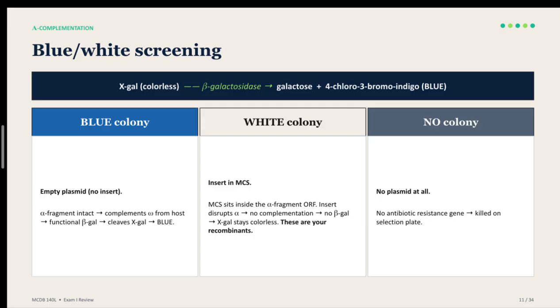We used BamHI and SalI directional cloning instead. But this is a very common thing in molecular biology. So I think it's pretty good to understand what's going on and what the different parts of it are, right?